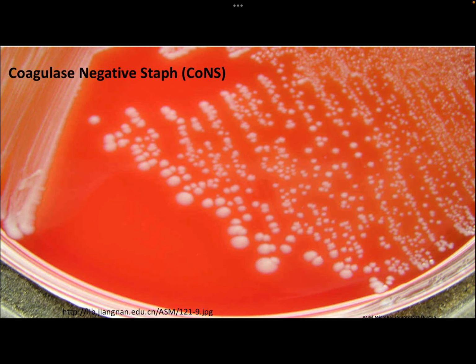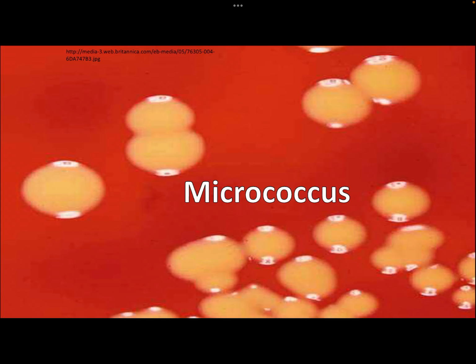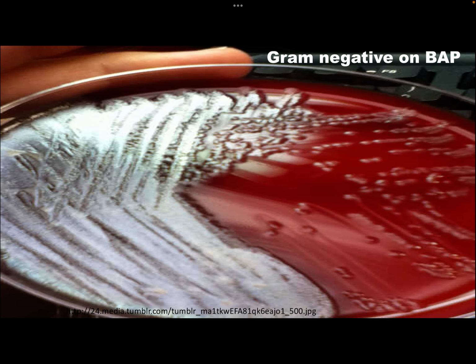This is an example of the white color of coagulase-negative staphylococci. Micrococcus is yellow or sometimes off-white. How about this? Again, large, gray, and somewhat mucoid. So these are gram-negative microorganisms.